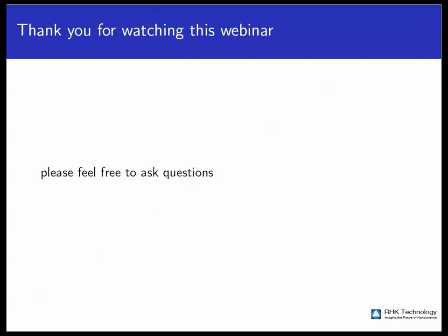Okay, there's a question. What range of Q factors is ideal for our PLL? Is there a Q factor that is too low to image stably? No, people have used the R9 PLL with Q factors of 200,000 and more, and that works fine.